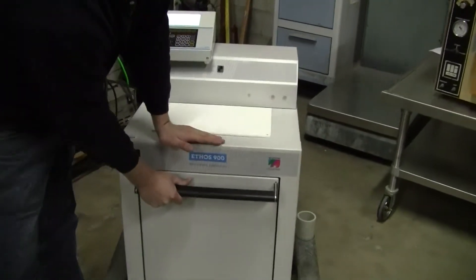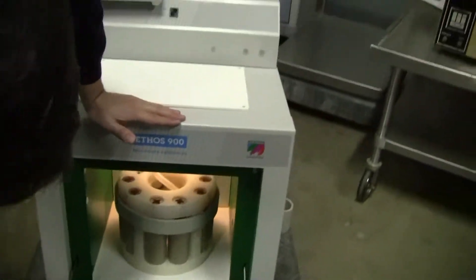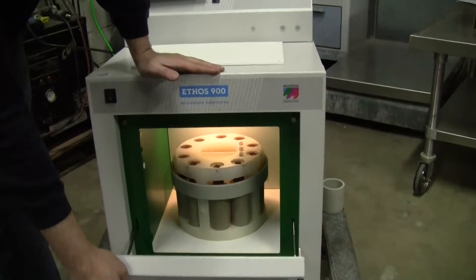Really quickly, let's take a look inside. It's off, it's venting, but we've got some light, we've got it spinning.